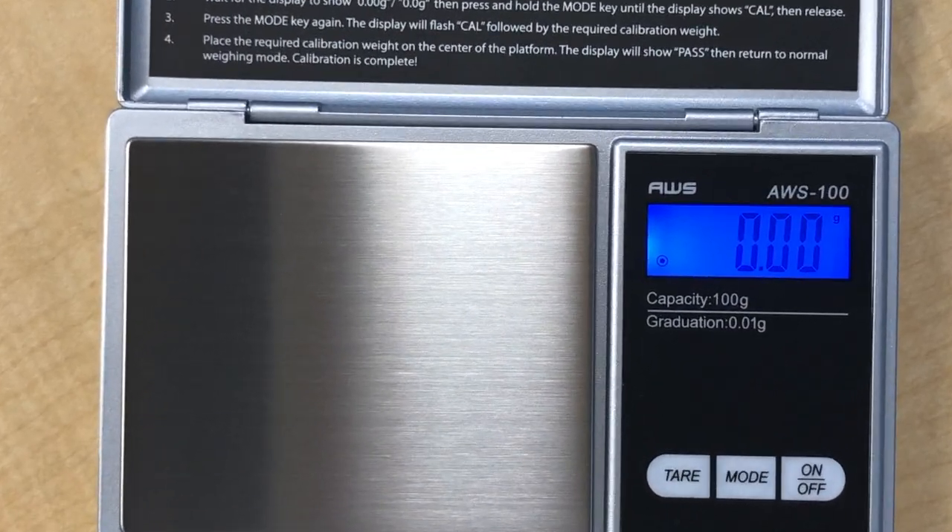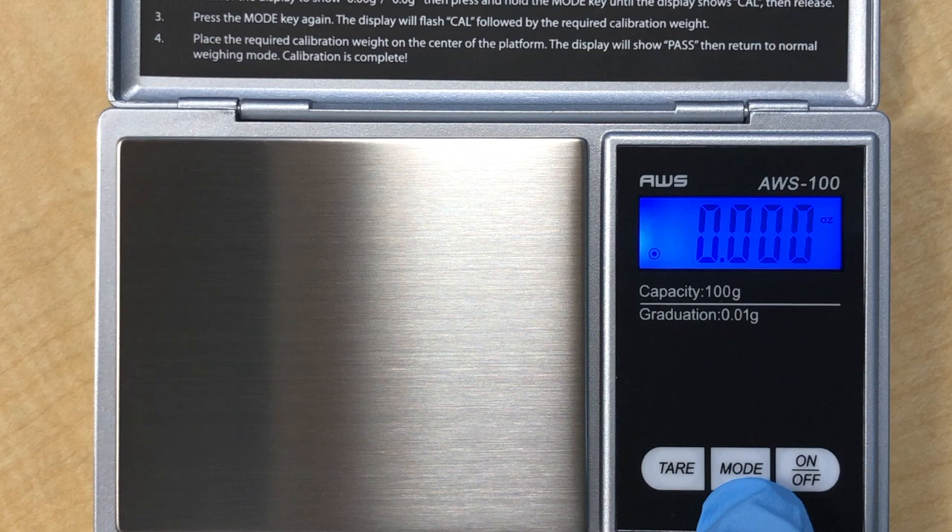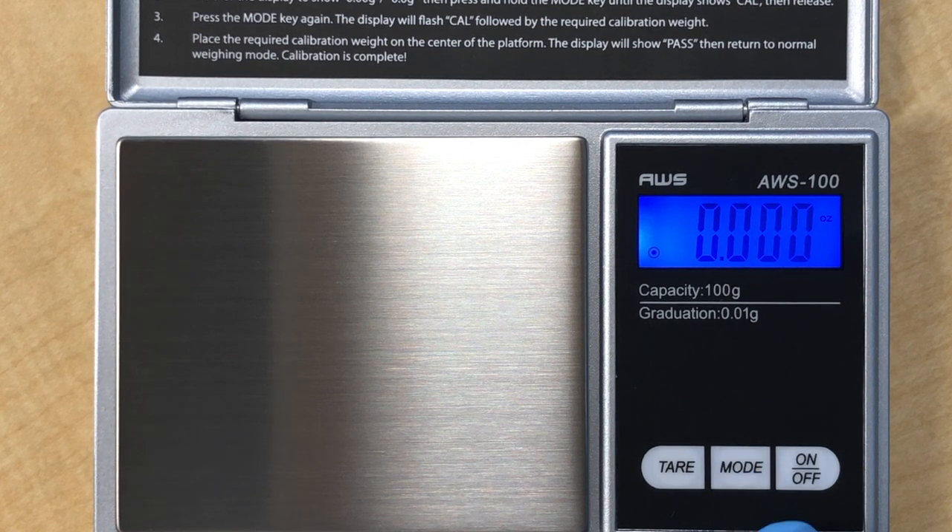Welcome to lab 5, the mole counting by weighing. This is a preview of the procedure that you will be doing in this lab.